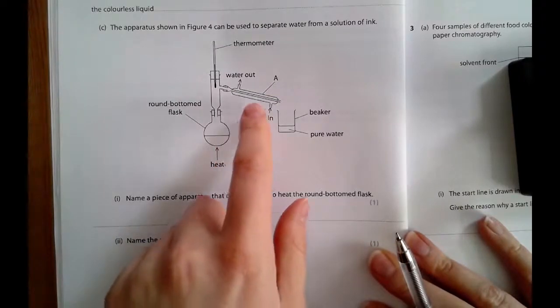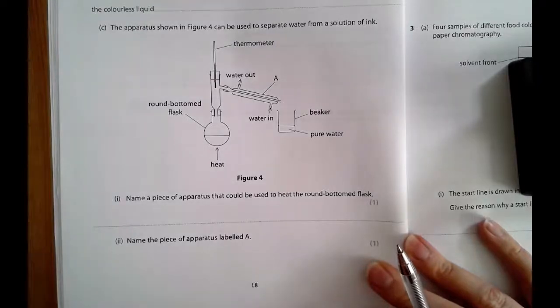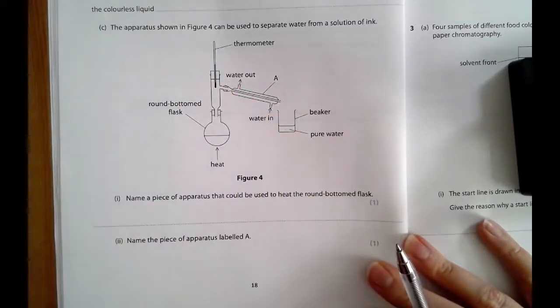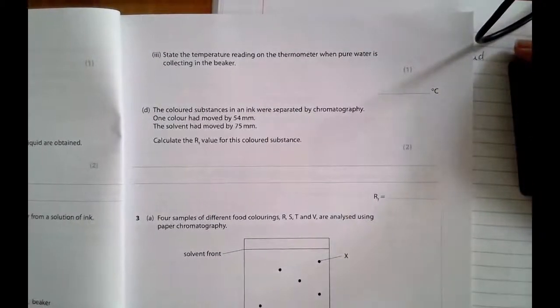Then I want you to label apparatus A. Apparatus A is your condenser. And you can see this time they've labelled it for you, in at the bottom, out at the top, but they could also ask you to label that. So it's called a condenser. State the temperature reading on the thermometer when the pure water is collecting.